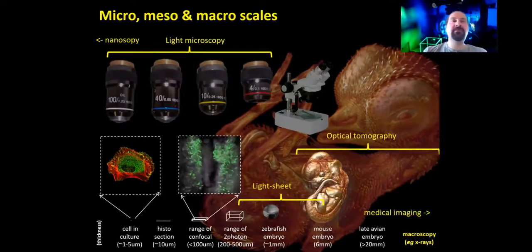Now, typically, most of you, I believe, are microscopists, familiarized with samples in this microscopy range, with magnifications up to 60 or 100x, where you can see, with a fair amount of detail, inside even individual cells. Now, if one cell is represented as this little dot on the screen here, you have this whole range of samples that we can these days actually put in a microscope and obtain fairly detailed information, even three-dimensional information, of.